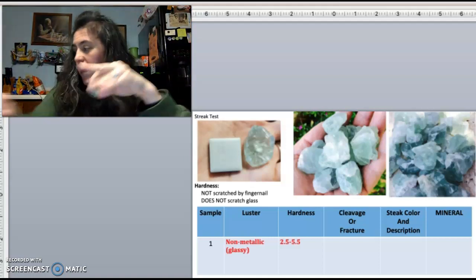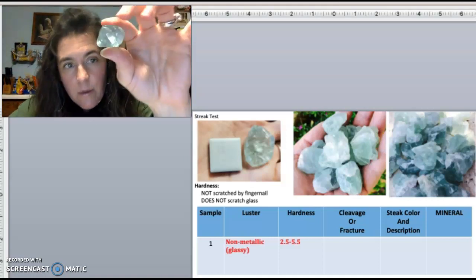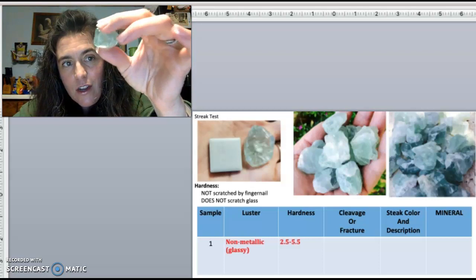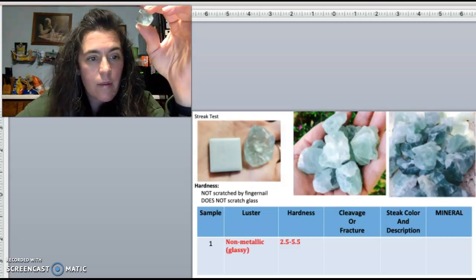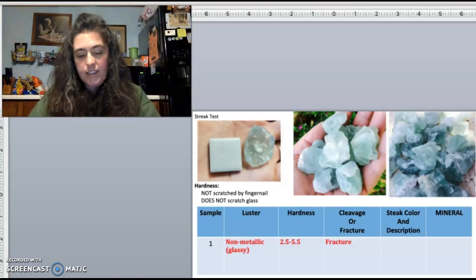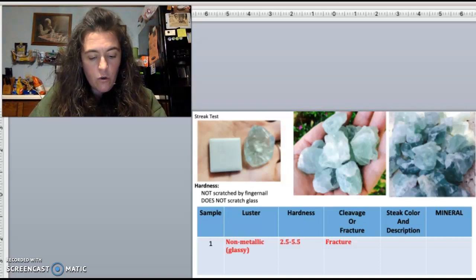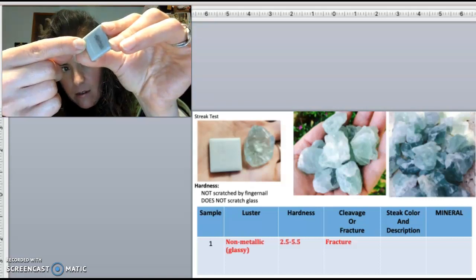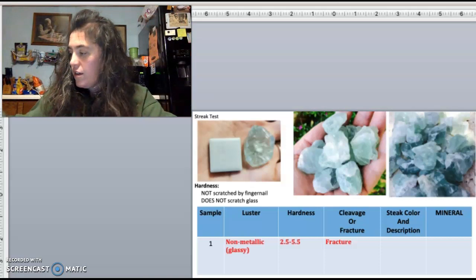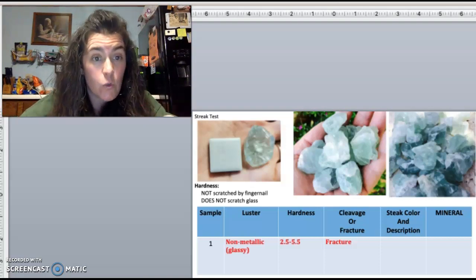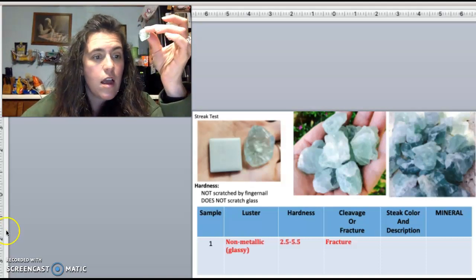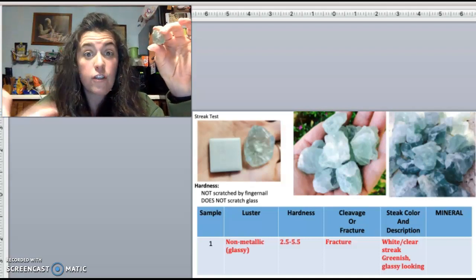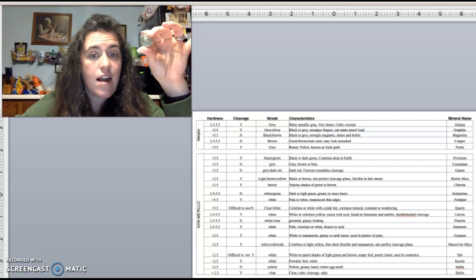Cleavage or fracture: looking at the pictures and my sample, there are no straight cleaved edges and no plane of cleavage, so this is definitely fracture. Streak color was hard to see, but you can make out a white streak here. Additional descriptions: definitely greenish in color and very glassy looking.